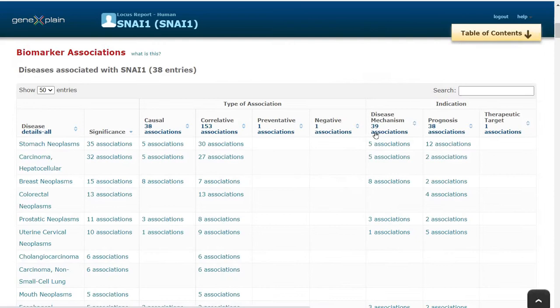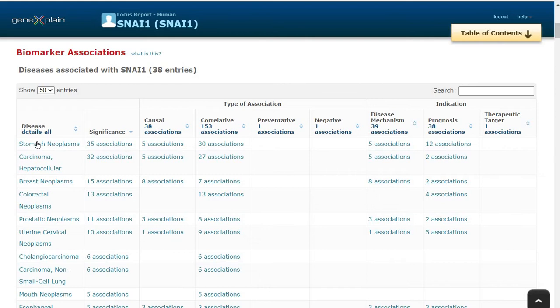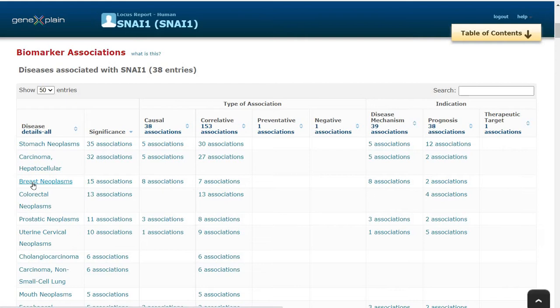Let's first understand in detail the biomarker associations. We can see Snail 1 or SNAI1 is a known biomarker for 38 diseases as curated in this database. We can see stomach neoplasms, hepatocellulocarcinoma, colorectal neoplasms, and breast neoplasms as associated with Snail 1.